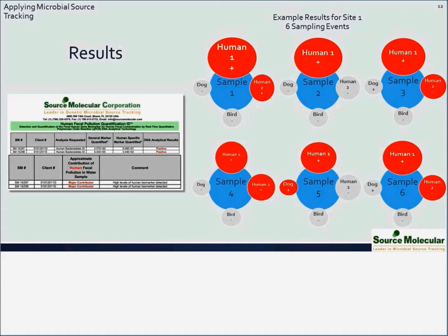Now you see an example here. There is one positive for dog. It could mean there potentially is dog there also. Now, can you tell exactly how much was from dog and how much was from human? No, you can't. But what you can see from this example data set is that human is most likely the significant contributor to fecal pollution at this site.